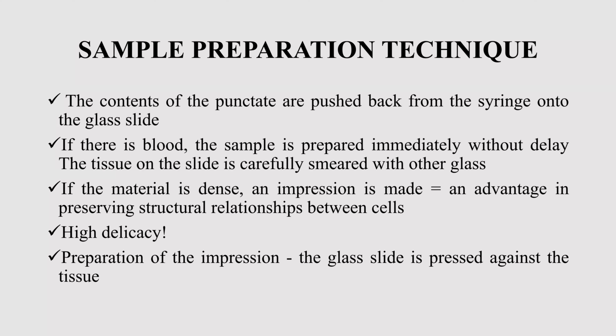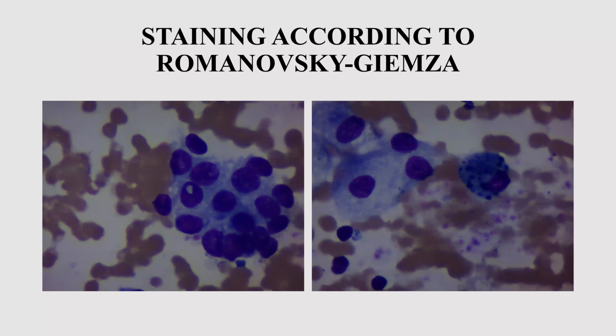This looks like that. It's the traditional Romanovsky-Giemsa staining. It's probably the most common staining in Ukraine.